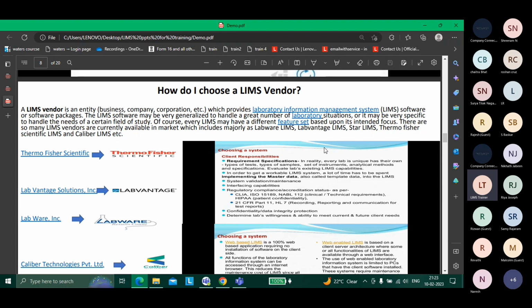But you see, there are different types of LIMS, right, which are built with their own programming languages. Some have client server architecture, some are web based. There are different types of billing rates by the creators of LIMS, based on licenses. So based on a number of factors, the pharma companies or whoever it is decide. Yes, someone was telling me something.